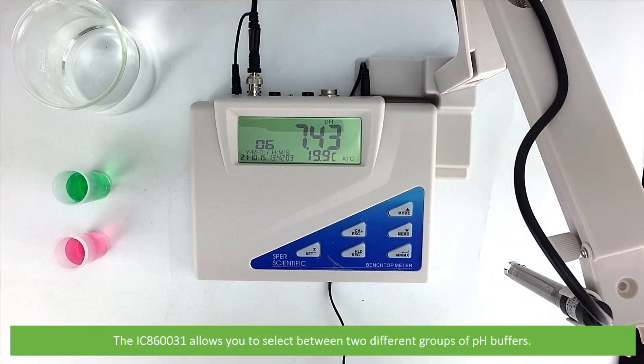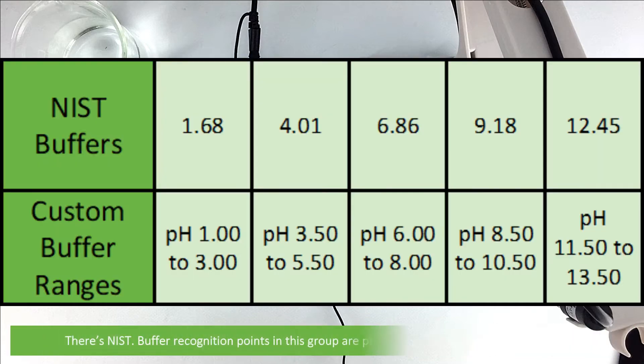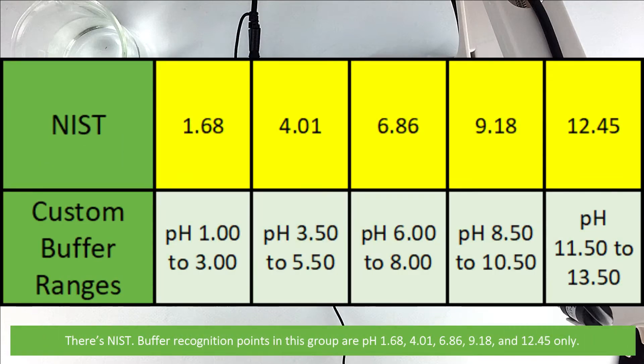The IC860031 allows you to select between two different groups of pH buffers. There's NIST. The buffer recognition points in this group are pH 1.68, 4.01, 6.86, 9.18, and 12.45 only.